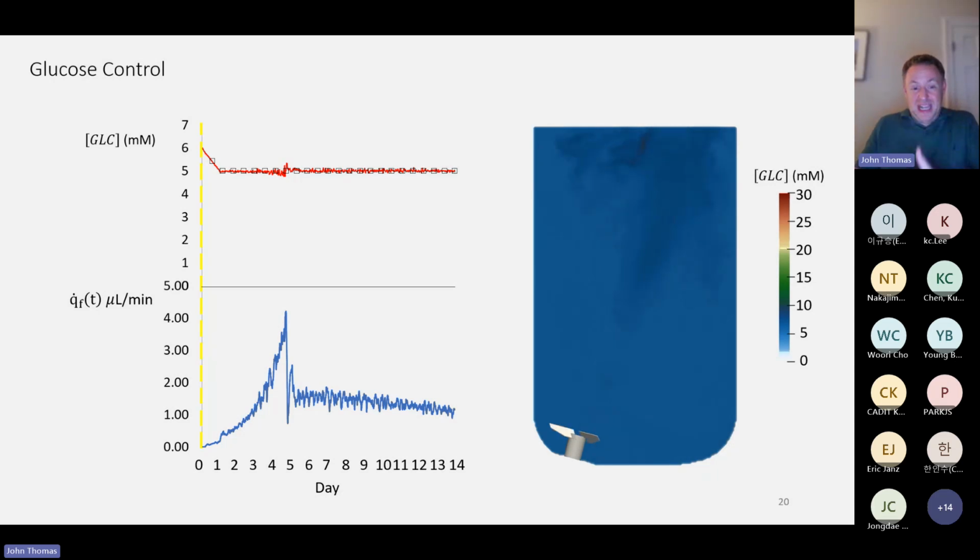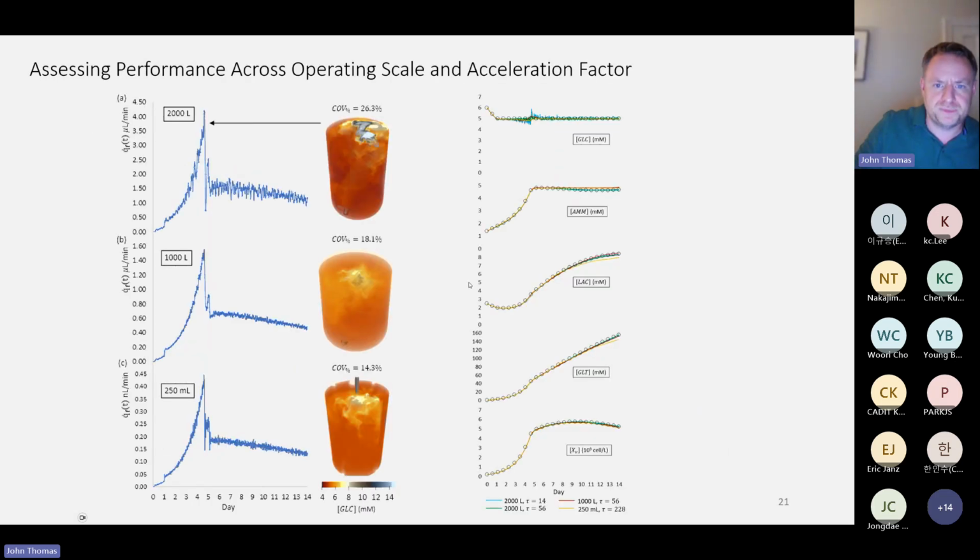We can use the simulation to optimize the feeding profile. We use the simulation to see how suboptimal PID parameters ultimately inform cell growth. That's what I mean by this holistic type of modeling. We have all the connections between operator topology, the system set points, PID parameterization, vessel topology, and cell growth kinetics. And we would put those all in one model. It allows us to see directly how we optimize system performance.